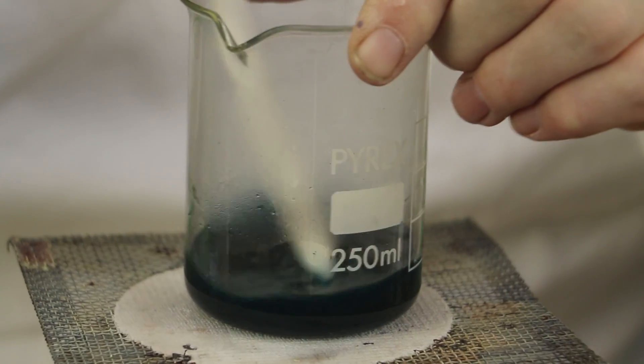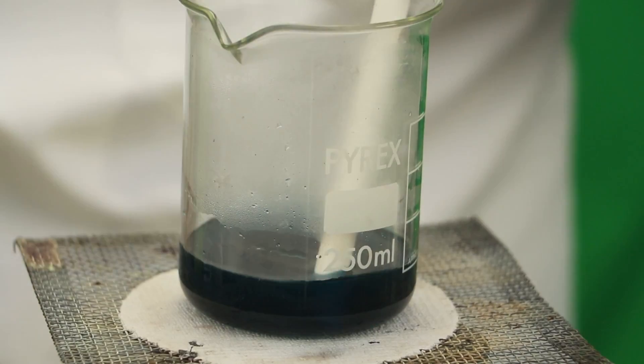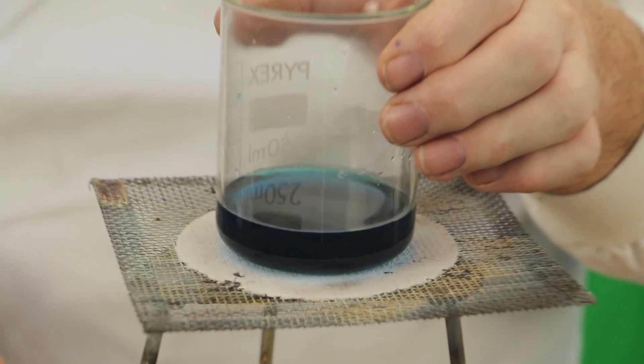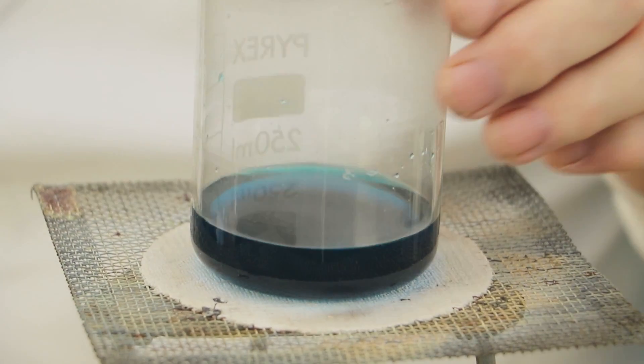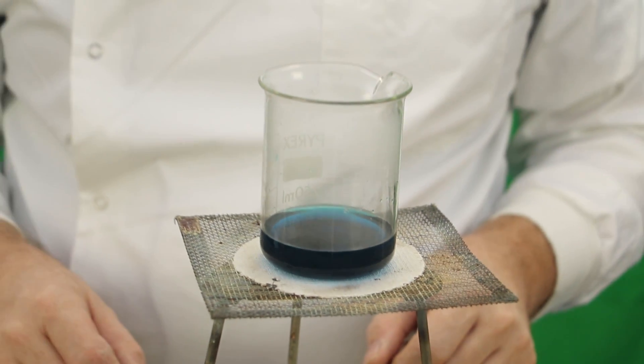After heating this for a few minutes a blue colour has started to appear and a lot of the black copper oxide has disappeared. The solution here we can just about see is starting to turn a nice blue. And now we are ready to filter off the black copper oxide.